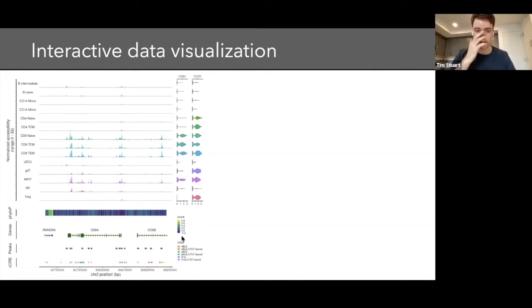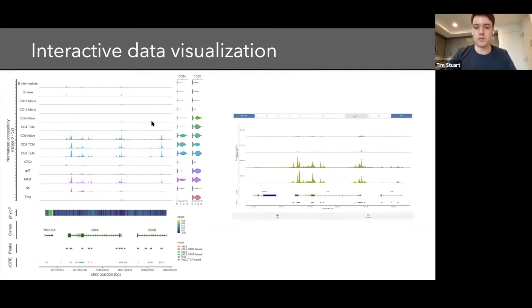So this is really great for exploring the data and generating static plots like this. But we've also developed a fully interactive version of these plots. We can create all the same plots, but in an interactive way that lets us scroll through the genome, zoom in and out in different regions, and view the data that way, which we find is a really powerful way to dive in and explore the data that we have.